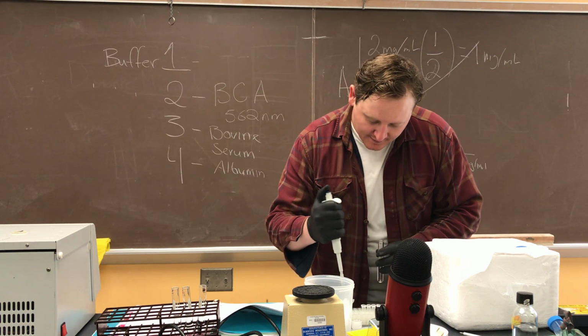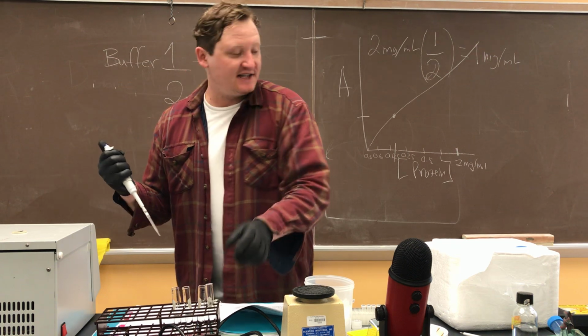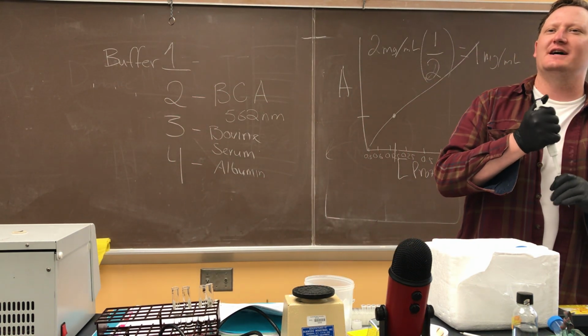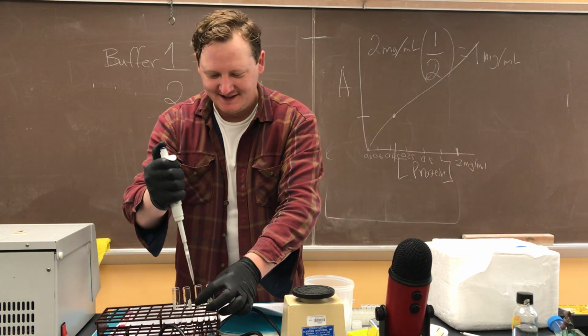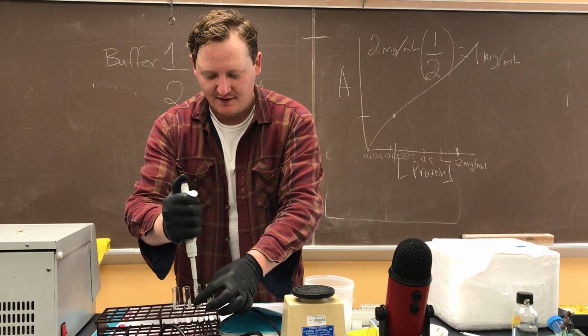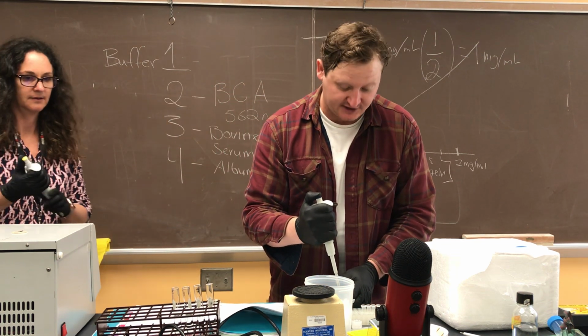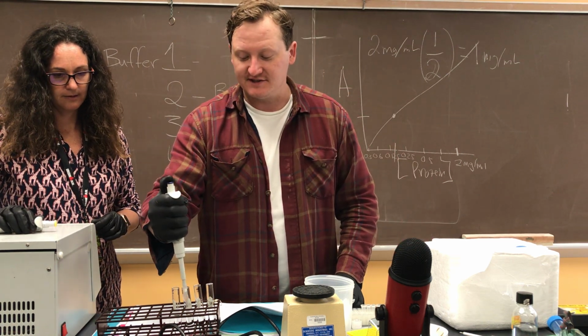We're going to bring the biohazard bin over. That's not a bad idea at all. Now, this is a non-virulent strain of E. coli, right? Yeah. So, it could be worse. Okay. Once again, economizing on tips. Normally, I would be changing the tip out between all of these different buffers, but this is for demonstration purposes.